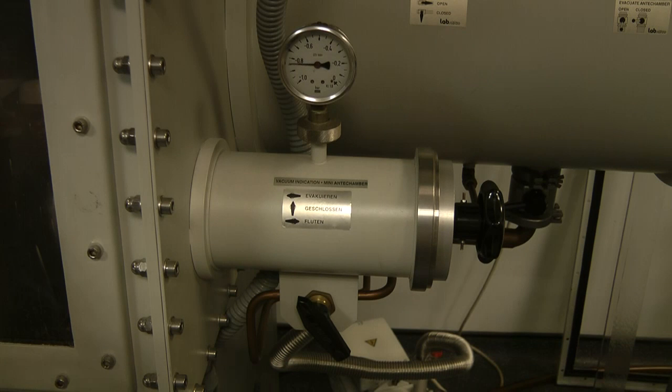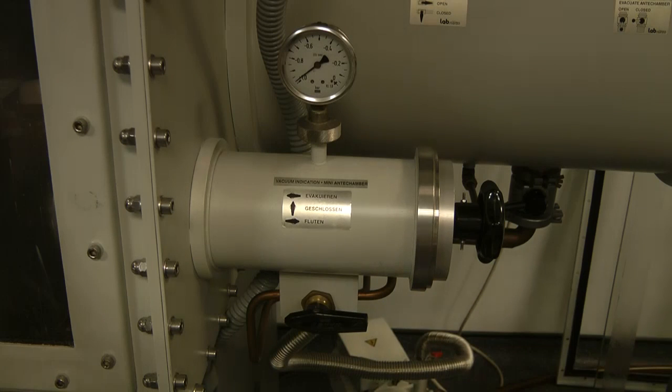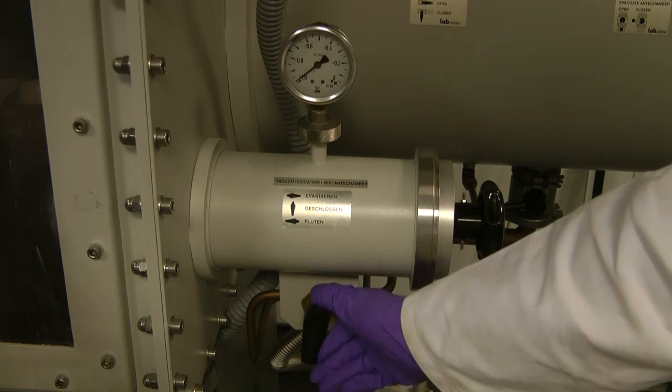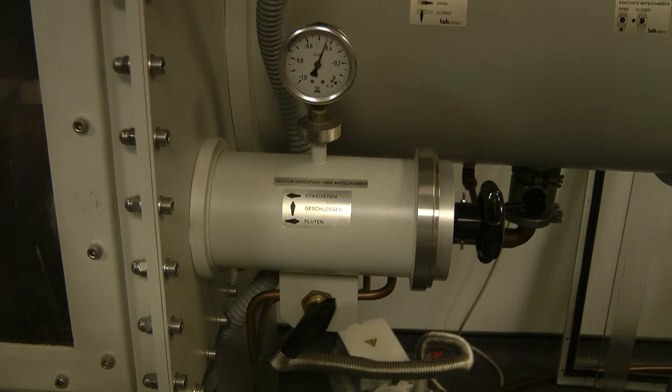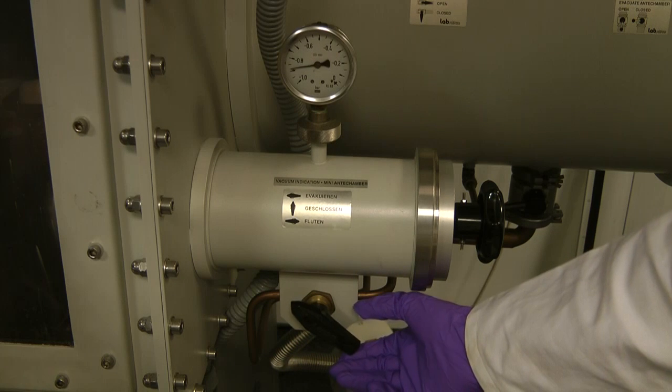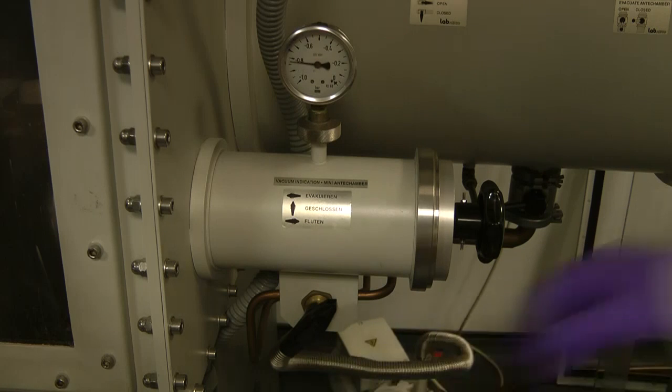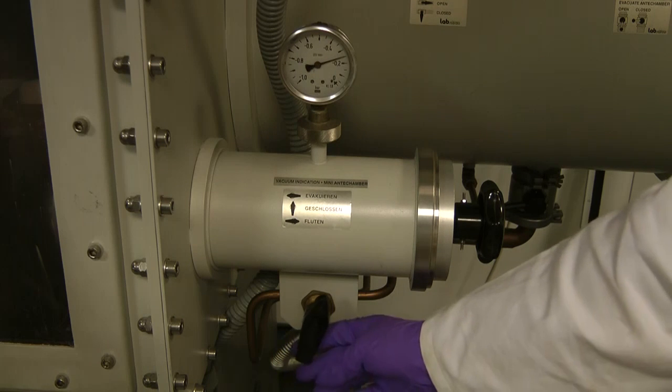Wait until the anti-chamber is fully depressurized, and then refill to about halfway. Repeat this process three times before finally filling it back up to room pressure. Each time you put the anti-chamber under vacuum, it's probably a good idea to leave it for about five minutes.